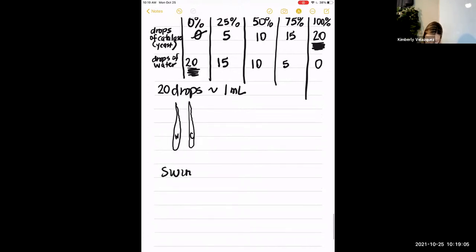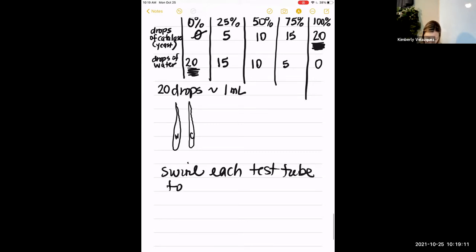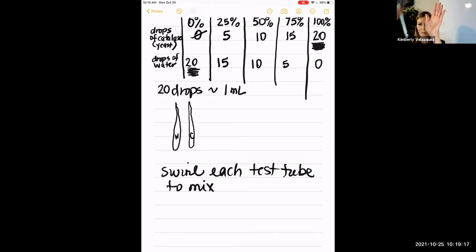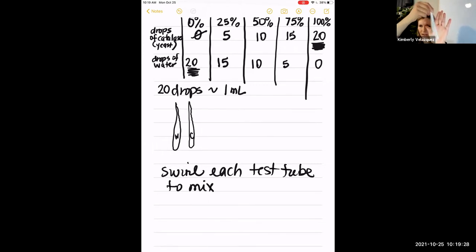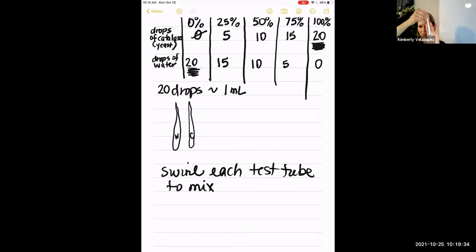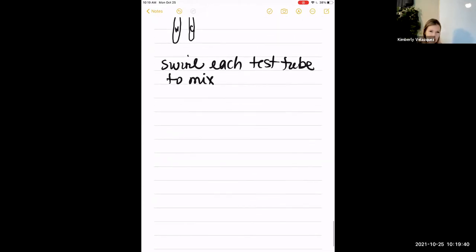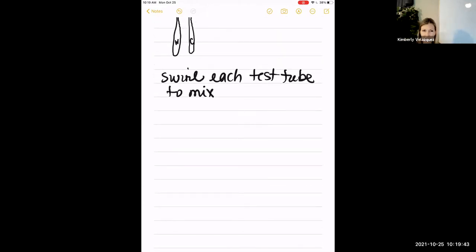A good way to mix a test tube is to hold it upright and gently bang it against the palm of your hand — you'll see a sloshing action that mixes it well. Make sure they're really well mixed; otherwise when you dip the disc you might just be getting water. The 0% is your control — it has no catalase, so it should stay at the bottom of the hydrogen peroxide because no oxygen is being produced.